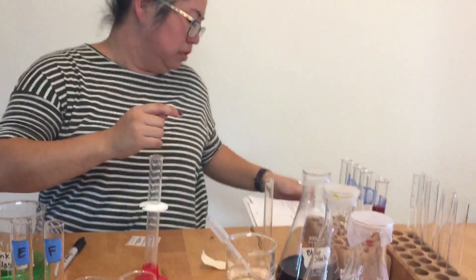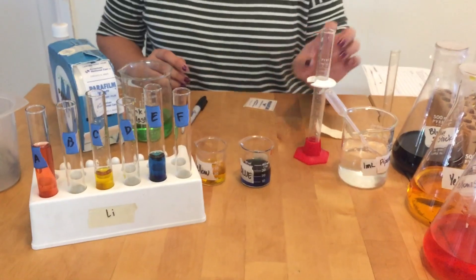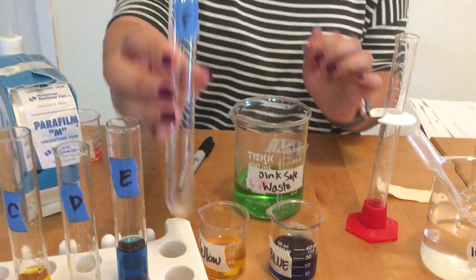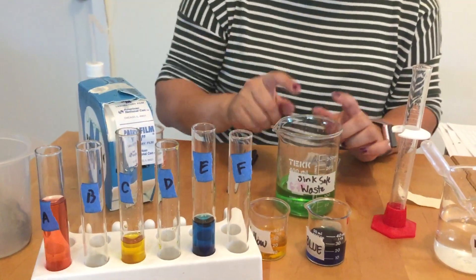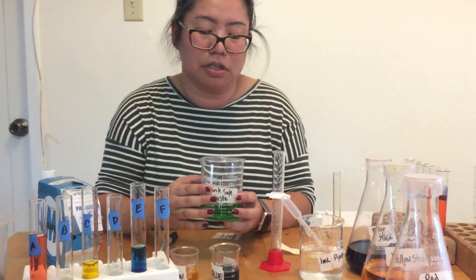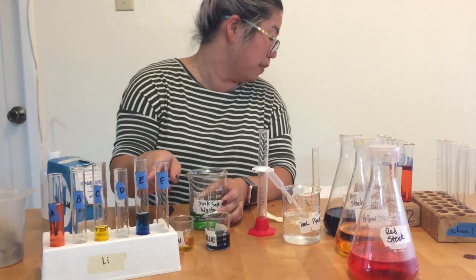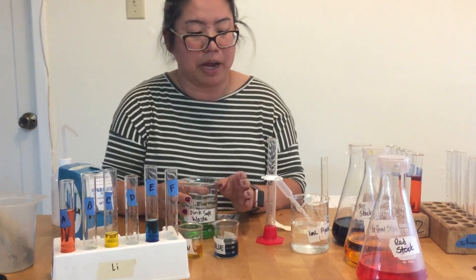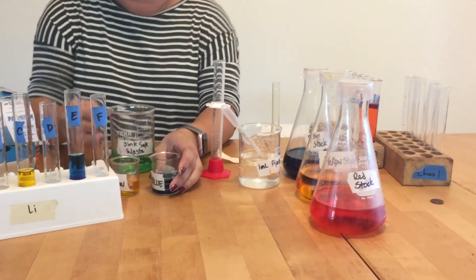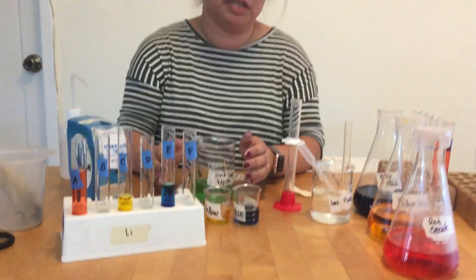Once you're done, clean up. Pour all the liquids into the waste beaker, then take all the labels off — labels go in the trash. Since this is sink safe, you can dump the waste into the sink and wash out all your test tubes with soap. Put all supplies back exactly where you found them. Stock beakers should be in the center of your counter and equipment back in the setup. A picture of what your setup should look like will be shown at the beginning of class. That's it.